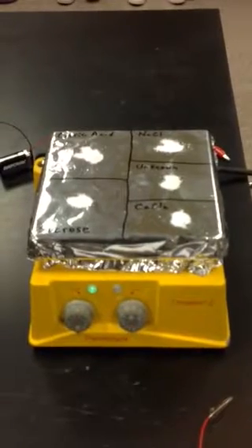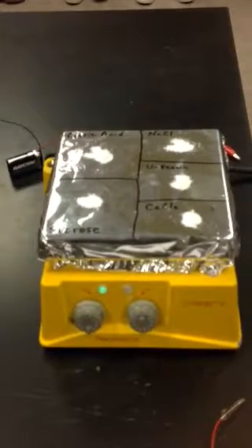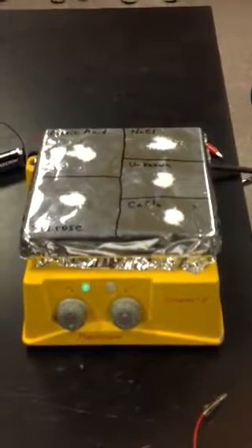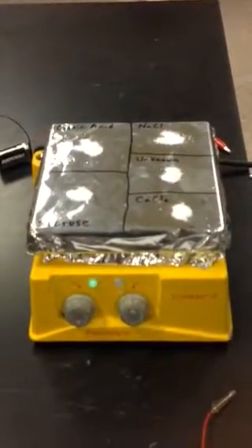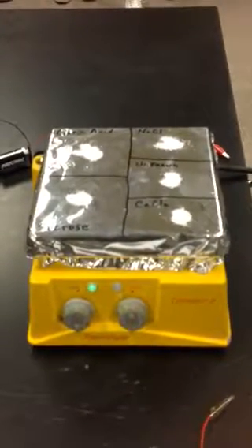Which one melted first? Because if it melts first, it has what? The lowest melting point. Okay, the lowest melting point. I don't see much of anything happening yet. This is almost like watching paint dry.